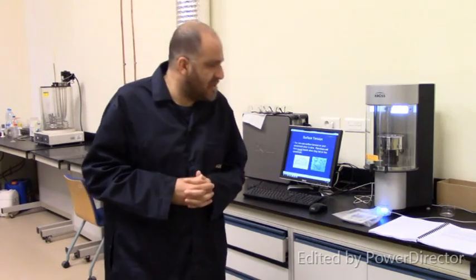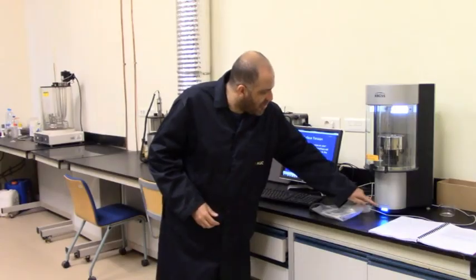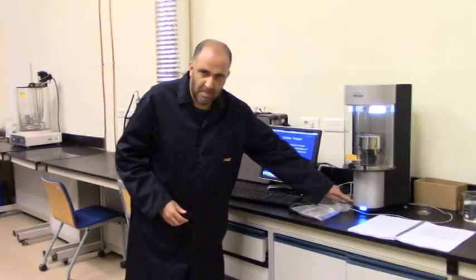Hello, dear students. Welcome to our experiment in measuring surface tension, wetted length, and contact angle. The purpose of this experiment is to find the contact angle, and we are using the so-called force tensiometer.